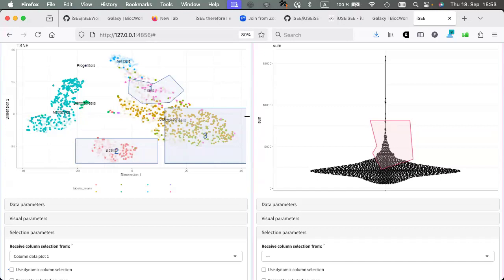because we have a volcano plot panel, but we can simply take a raw data plot and say I want to put the log fold change on the x-axis and the y-axis has to be the log p-value. You don't have an official spatial plot, but you have the x and y coordinates of your cells in the column data.